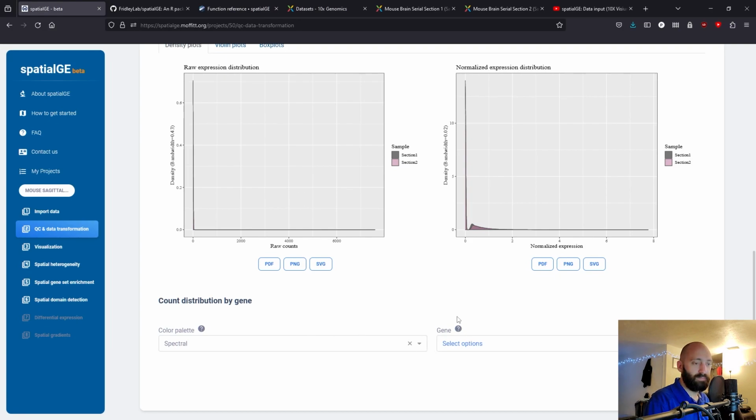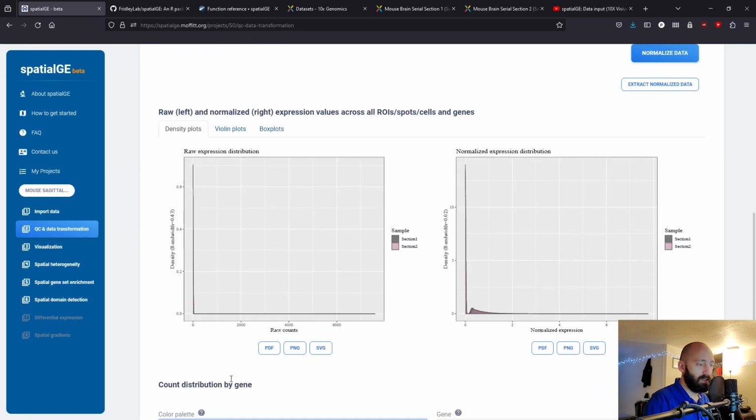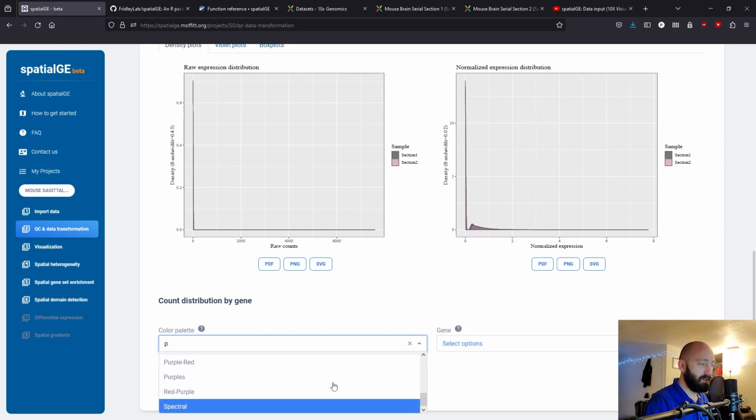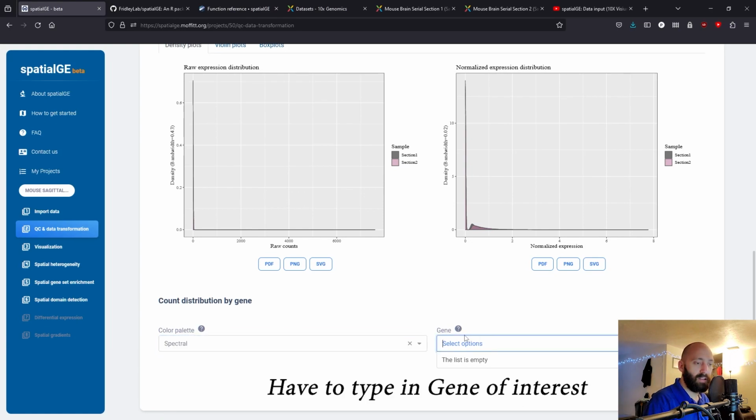Let's see, gene empty. We'll stick with spectral. All right.